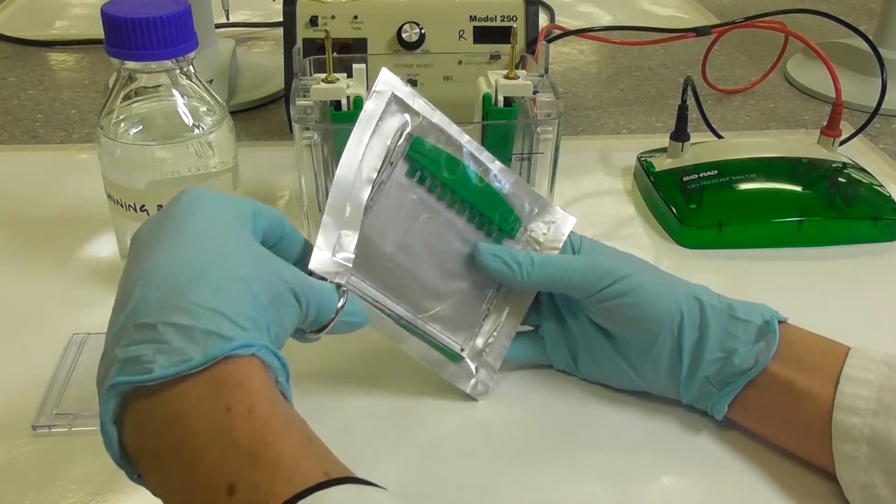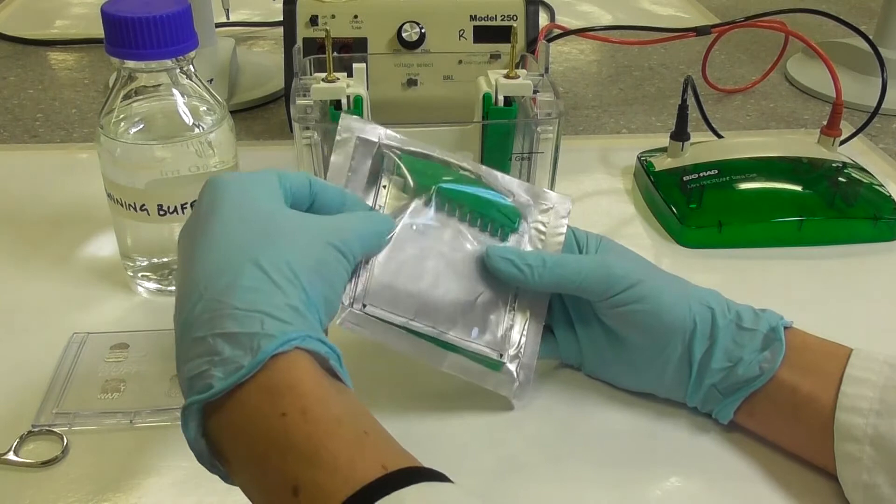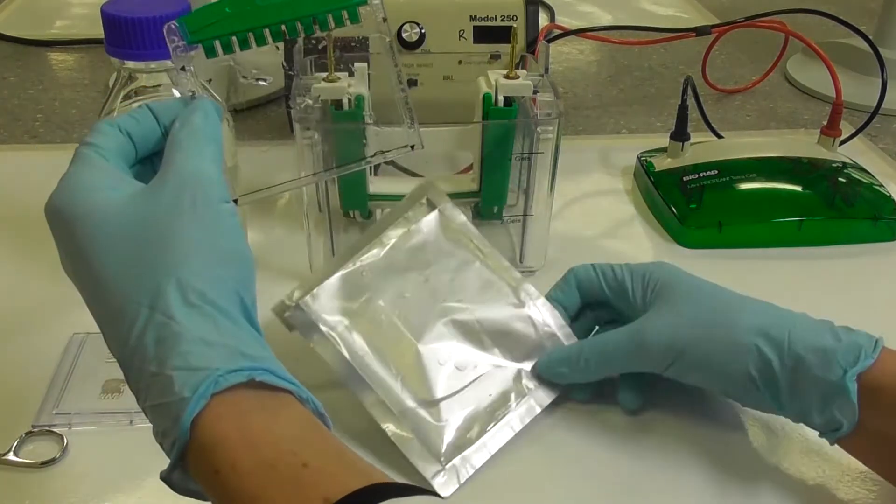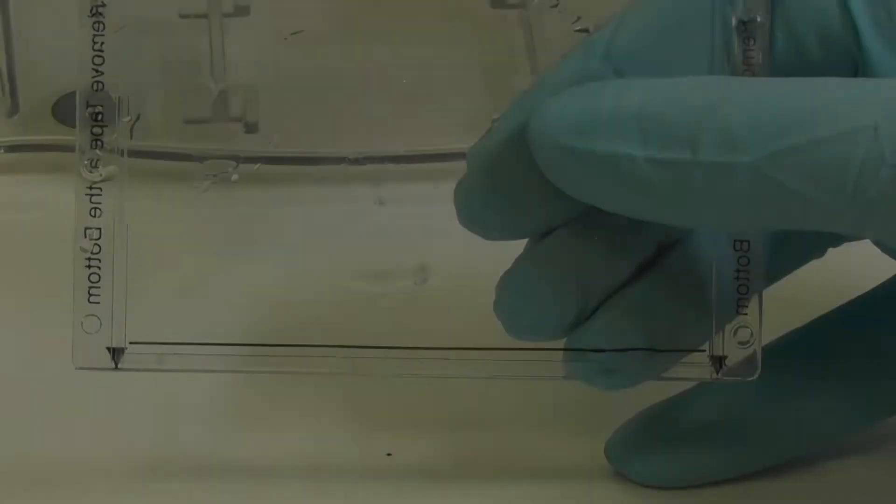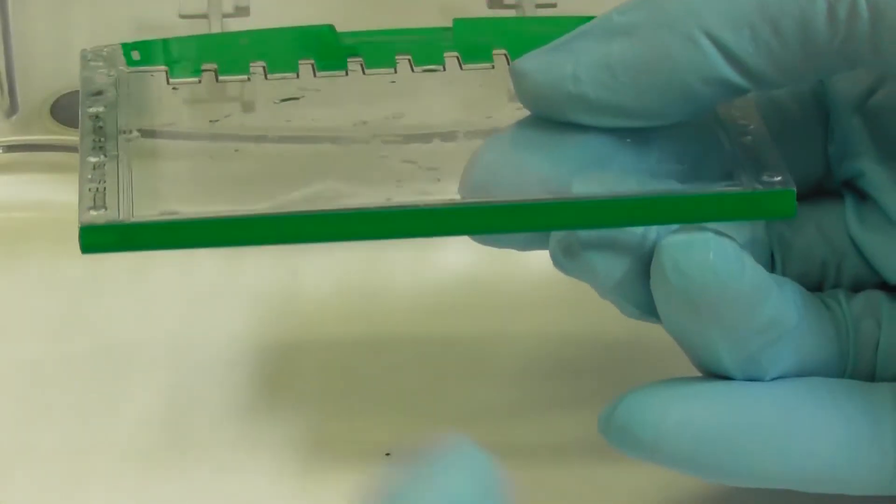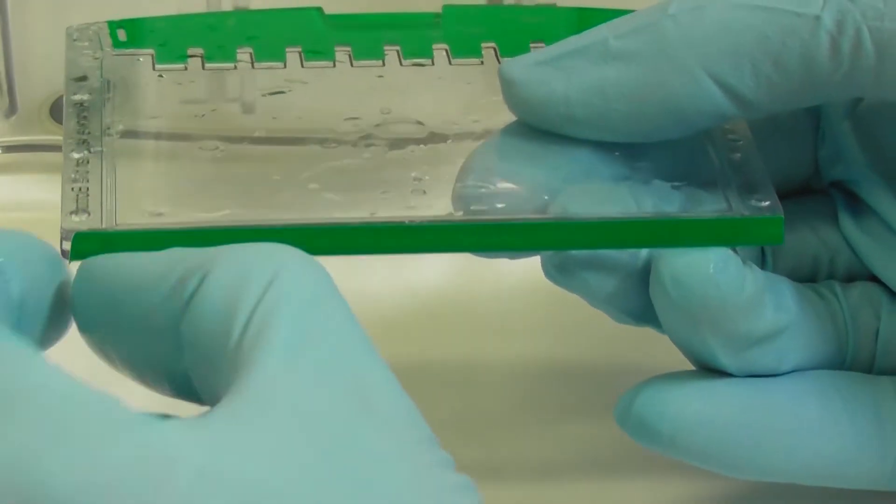Remove the precast gel from its packaging. Scissors may help if the tear tab does not work. The bottom of the precast gel is sealed with a strip of tape which must be removed before use.